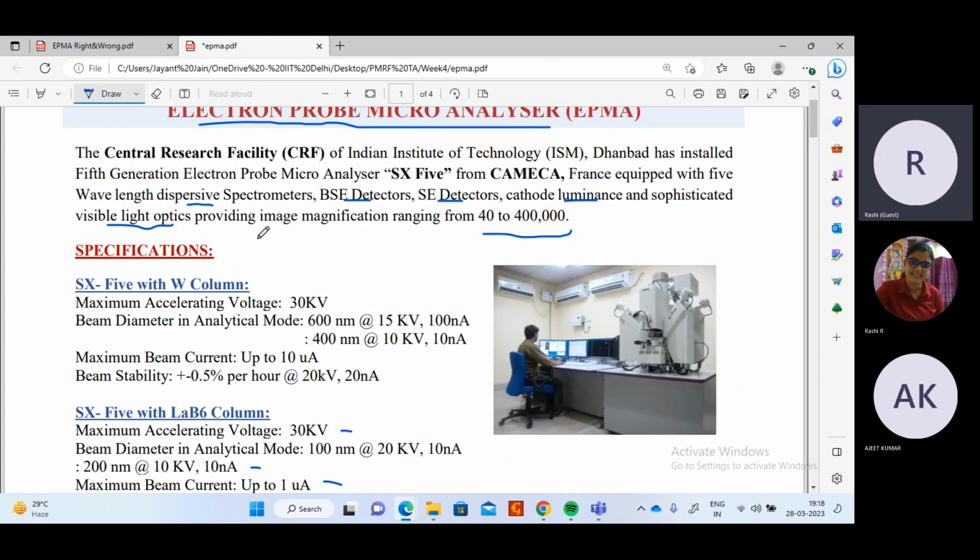We will be able to analyze the standard samples. With respect to standard samples, you know how the industry works, right, Ajit? They produce in mass. For instance, consider an aluminum industry. They have to produce some 6,000 series, probably 10 tons or 20 tons or 1,000 tons, something like that, in a big industry.